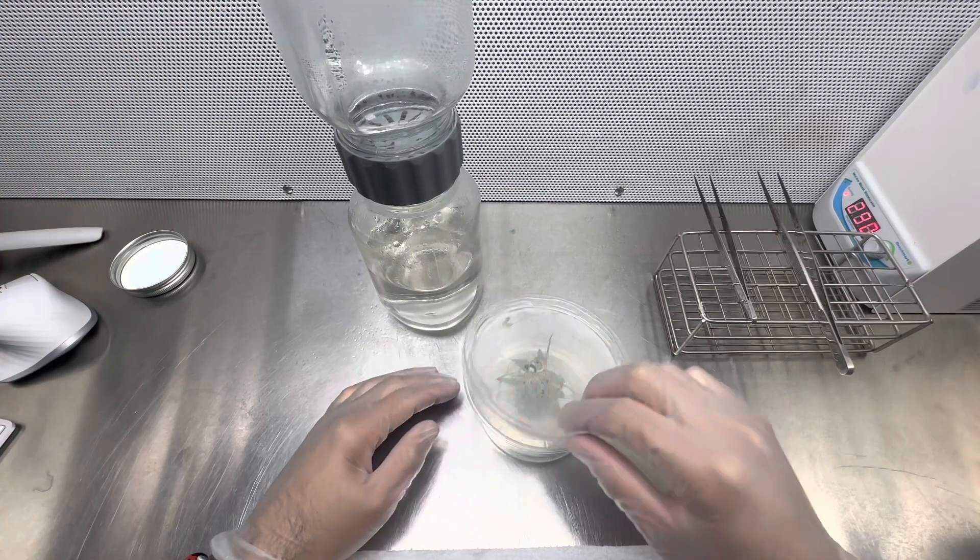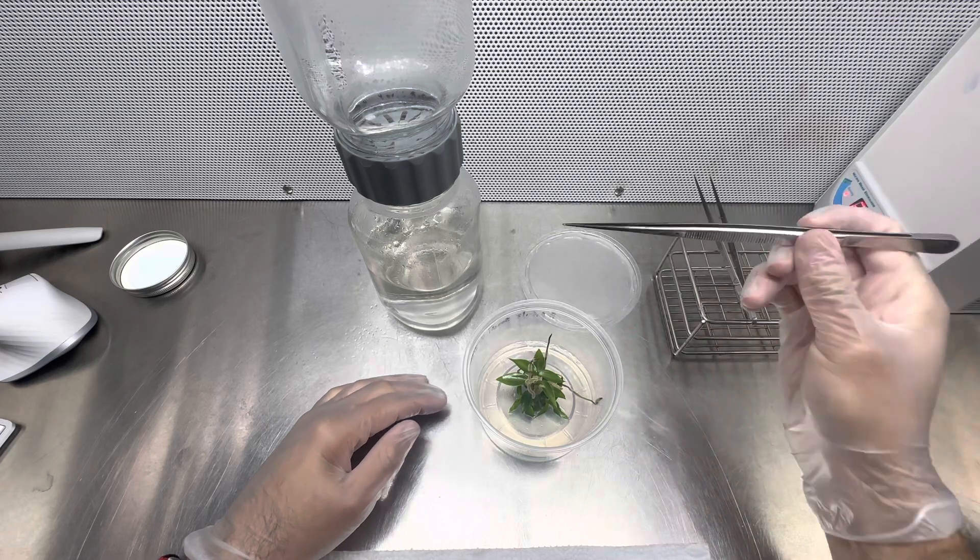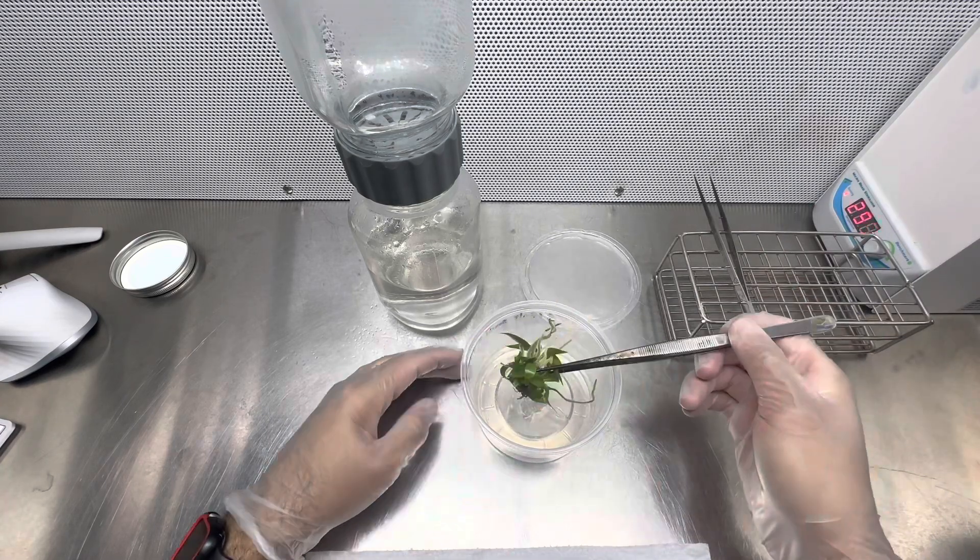Instead, take your sterile forceps and place the plant in the bottom jar with the media. That's going to make it a lot easier, and that's it—it's that simple.